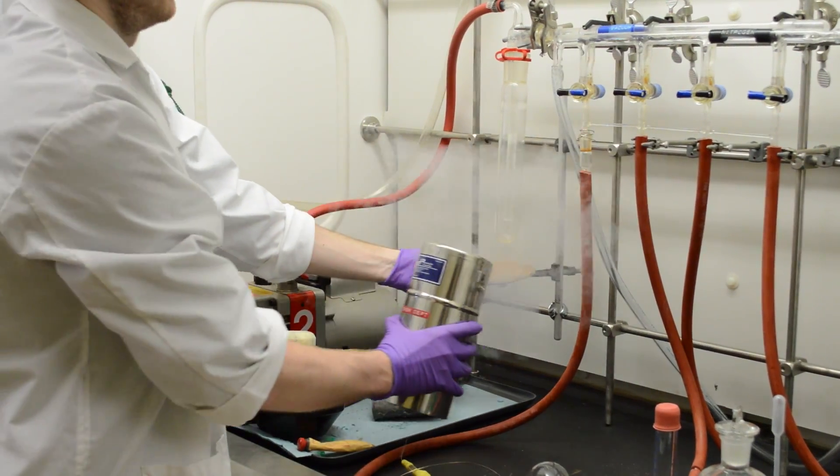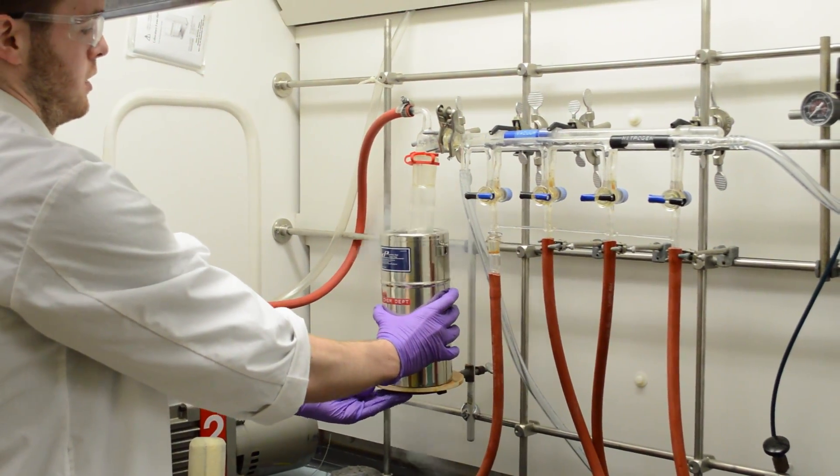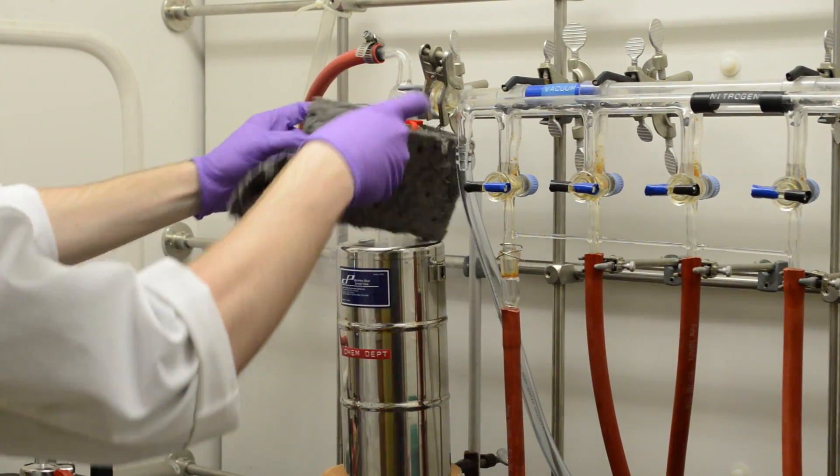Okay, so we use liquid nitrogen on the trap here to collect any solvents that will run through the system when it's under vacuum. So it will all collect in this vessel here.